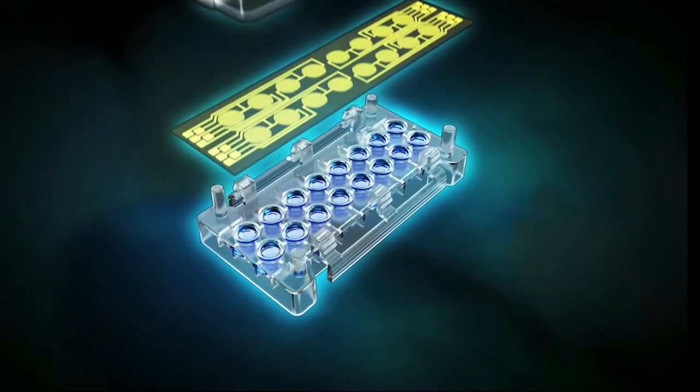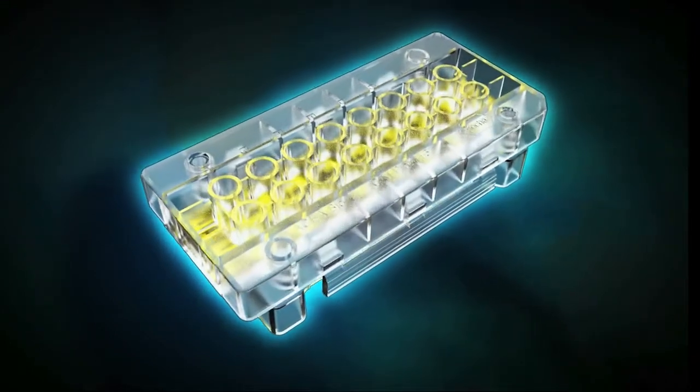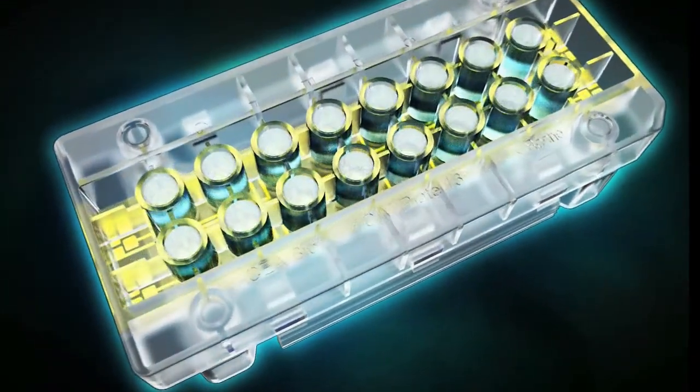Chemoattractant is placed in the bottom chamber wells, while in the top chamber, study cells are seeded onto extracellular matrix, or ECM, gel.